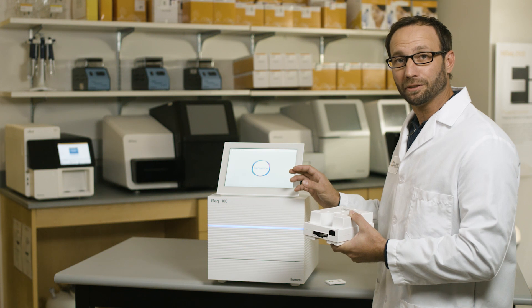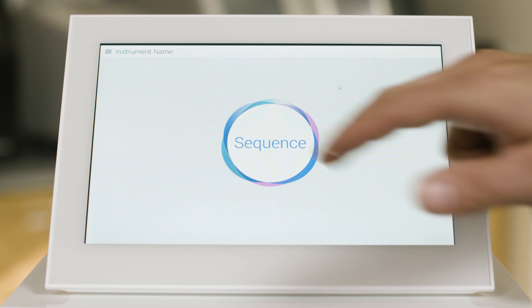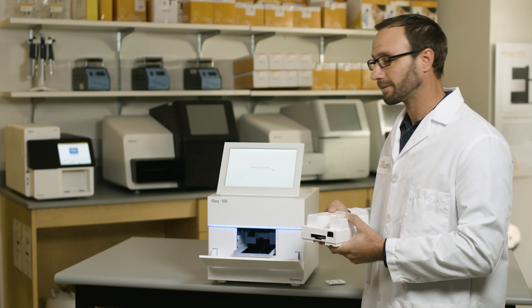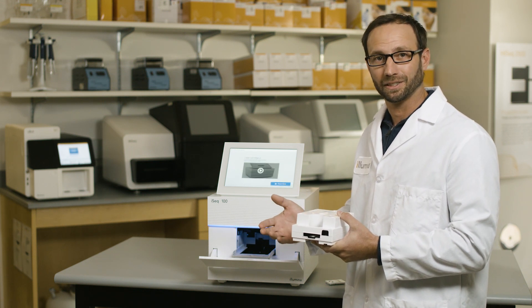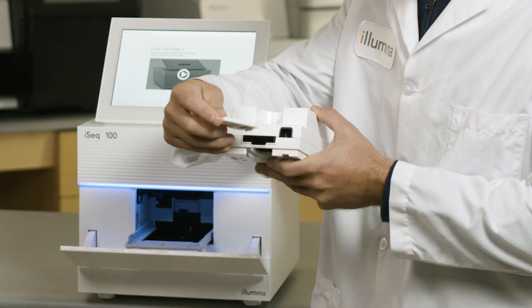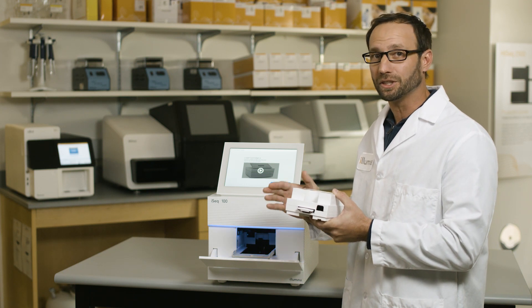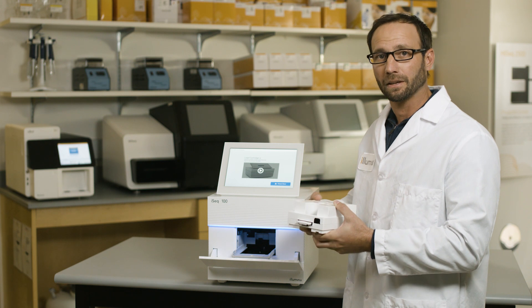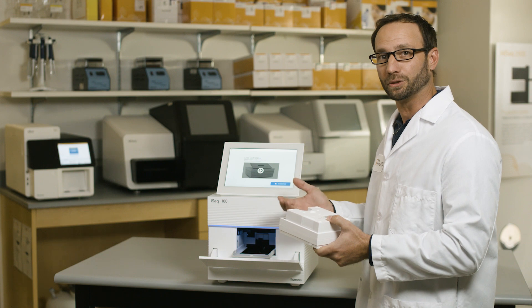With the intuitive user interface, starting a run is super easy. To start, touch the sequence icon. The system will prompt you to load your prepared library into the iSeq 100 cartridge. Next, insert your flow cell into the cartridge. With the key design of the flow cell, there is virtually no chance that the flow cell and cartridge can get assembled incorrectly. Load the cartridge containing your library and flow cell on the tray and press the close door button.